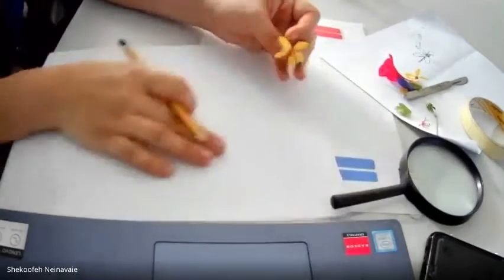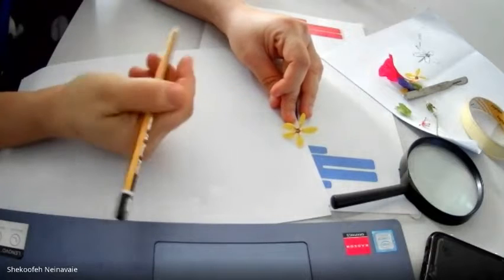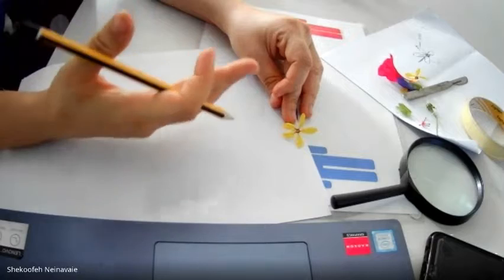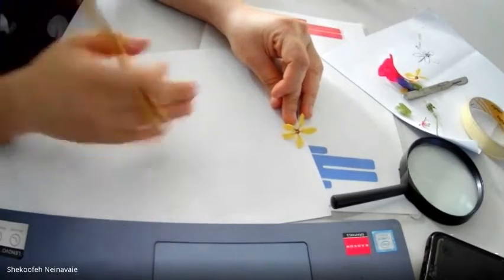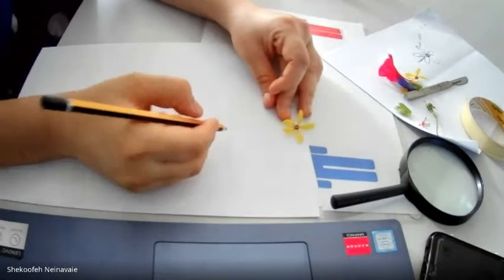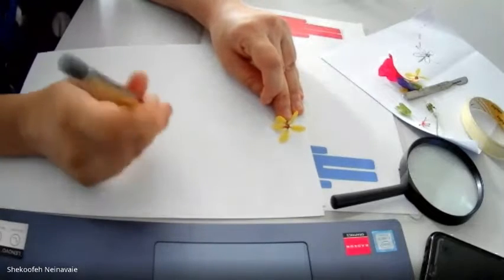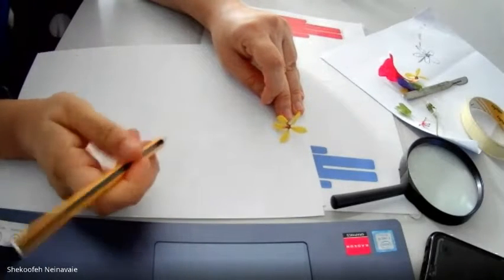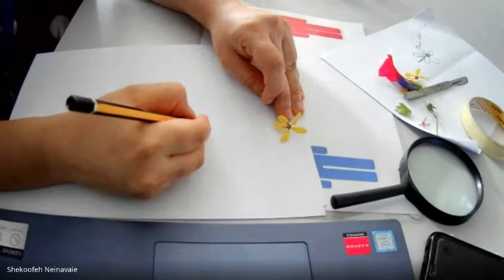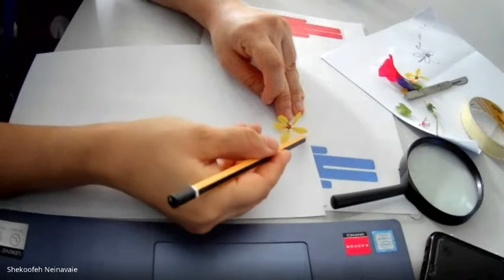Now, I first draw whatever I see, the morphology or anatomy of this flower. I just want to draw the outer features, whatever I see in the exterior of this plant, because I have not done the dissection yet. As I told you, you do not need to do the shading. You should not use a pen, it should be a pencil, sharp enough. The line should not be broken and should be continuous. It's very important. I check everything.